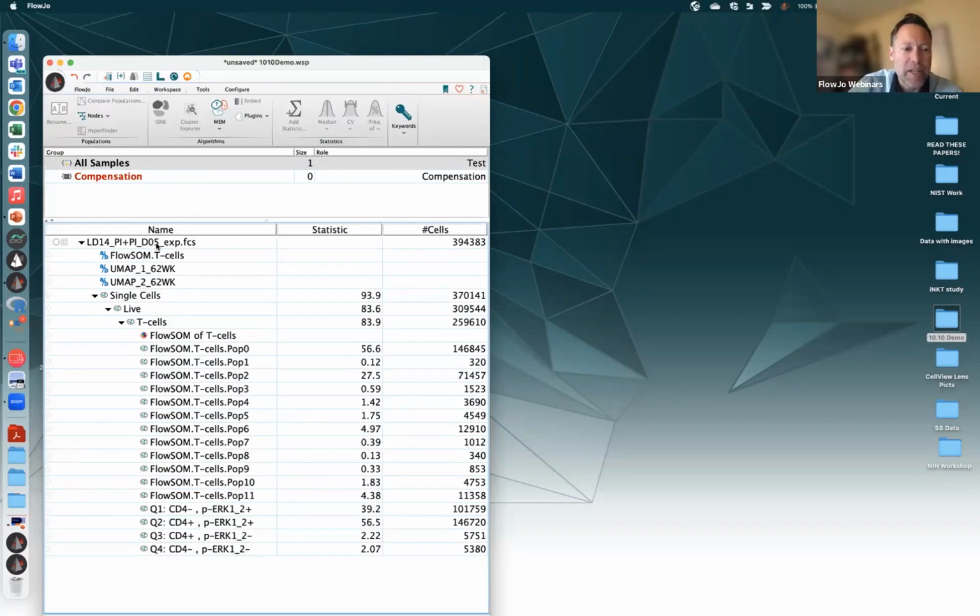I've clicked on the things that I want to apply UMAP to. Could be a particular level of the population. Maybe I wanted to do it on the T cells. If I apply it to T cells and everything upstream of that, and I were to show it on the UMAP plot, if I said UMAP the top level, they would get a 0, 0 value for the UMAP. So it's fine. You'll just only see the things that you've UMAPed. So choose which level you want to do it at. It probably takes a little longer to do it for more cells, so pick the one you're actually going to work on.